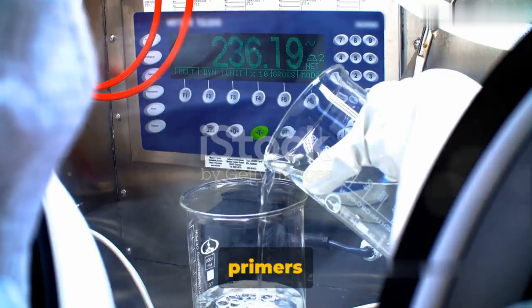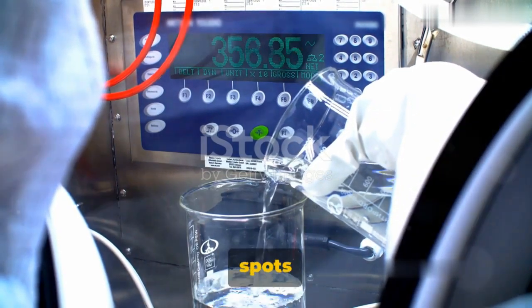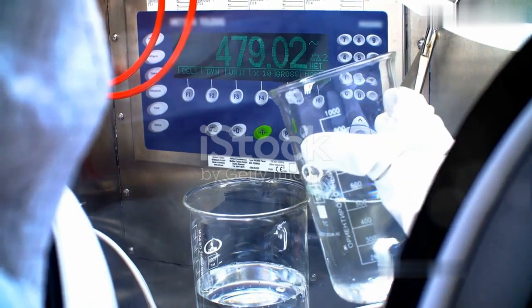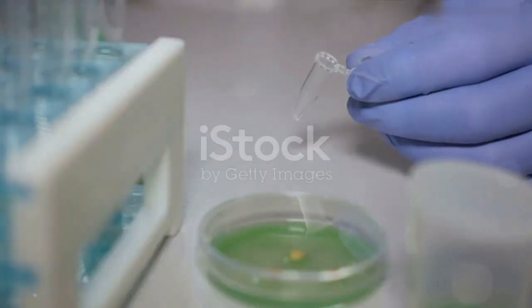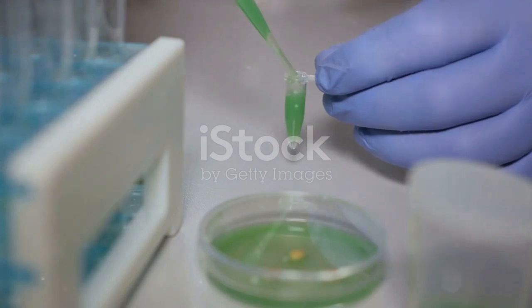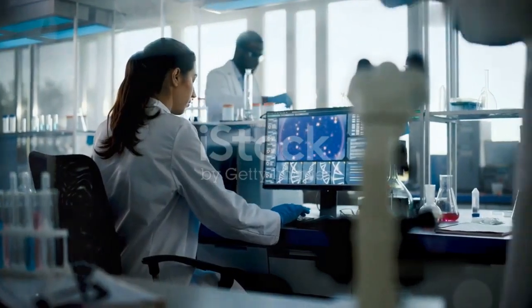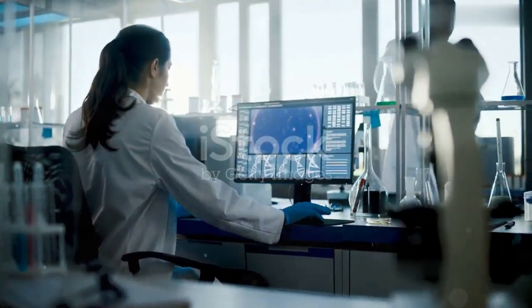Next, we have the oligo-dT primers. These oligonucleotides, usually 12 to 18 nucleotides long, contain a repeating segment of deoxythymidine or dT. Their job is to bind at the poly-A tail of mRNA, which is a unique feature of these primers. Finally, we have sequence-specific primers. These are short sequences of nucleotides that target a specific region of interest on the sample RNA. These primers are typically used in one-step RT-PCR, where both reverse transcription and PCR happen in the same tube.